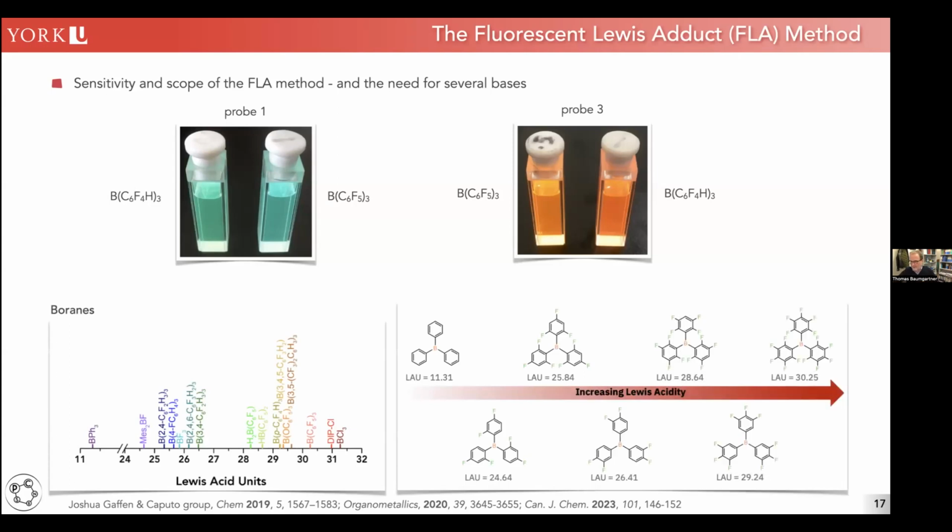And then we can do that for an entire range of boranes, as an example. They usually work the best. For illustrative purposes, I just want to show you the fluorinated triphenyl boranes. You can see we have an increasing Lewis acidity as a function of the number of fluorine atoms, but not always, because here we have 2 fluorine substituents per phenyl, here we have 3, but here we go back to 2. So the position of the fluorine also makes an impact. It's a matter of -I and -M effects that we're combining here, and you can see a very nice trend depending on the positioning of the fluoride substituents, but also the number of the fluoride substituents.